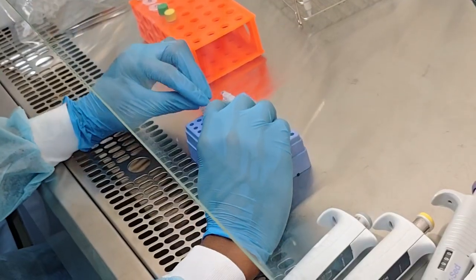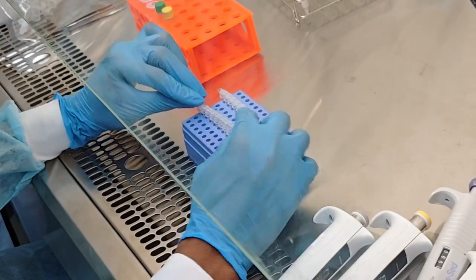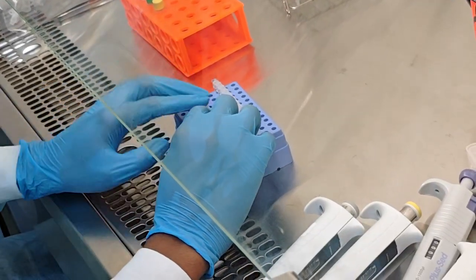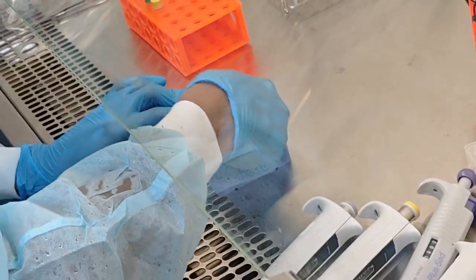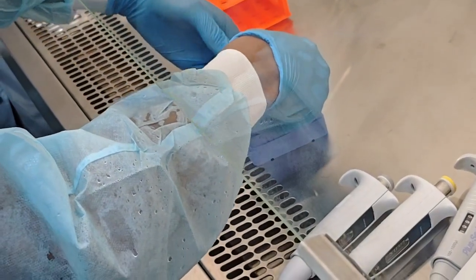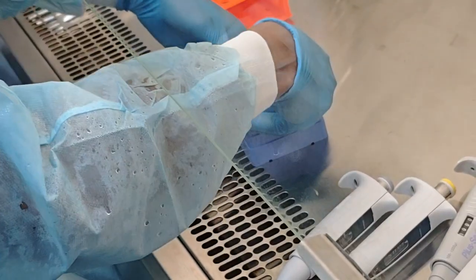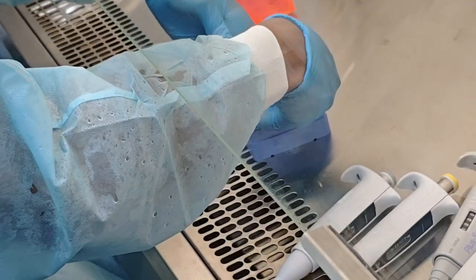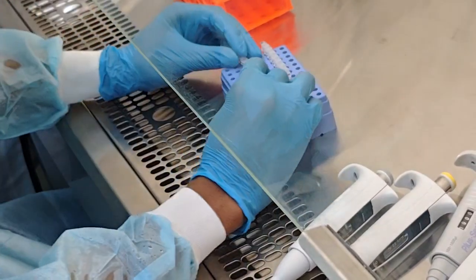This step, we need to press every cap tightly to the tube. You can hear the sound, just press tightly. Make sure drop.